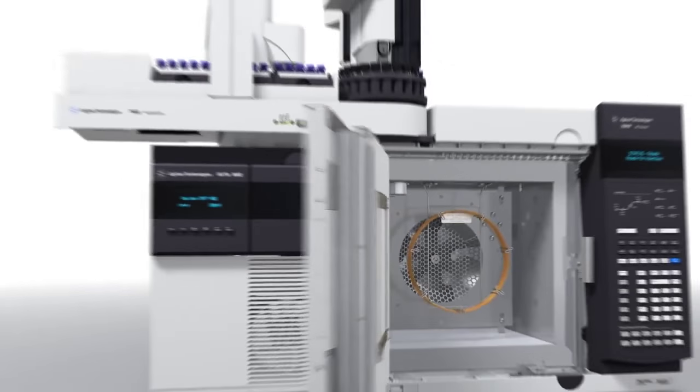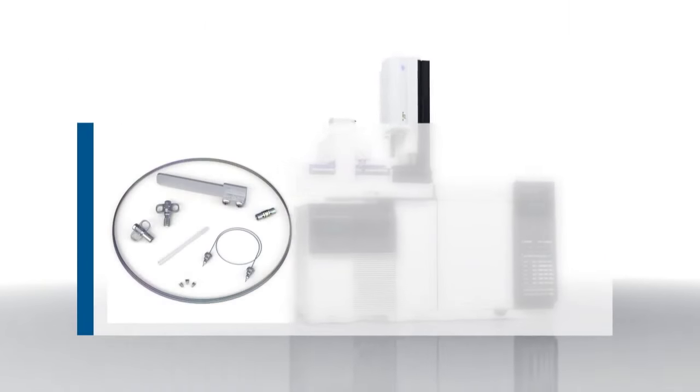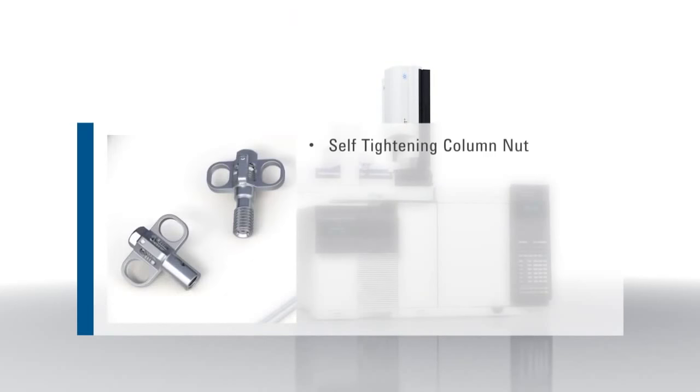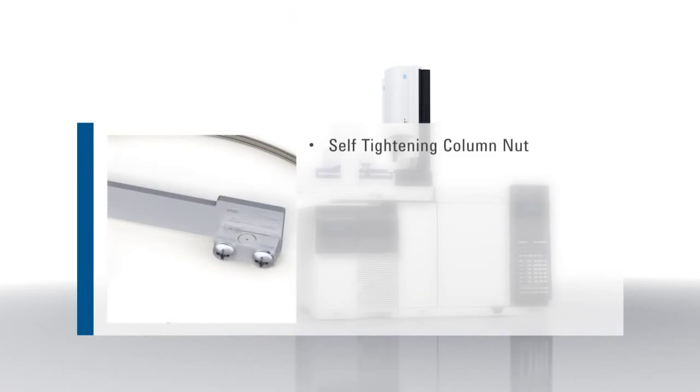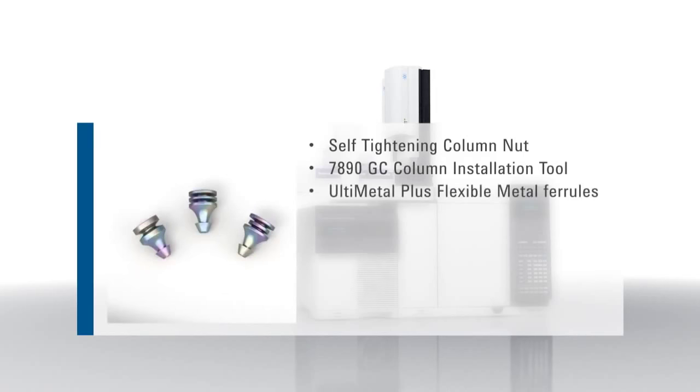With these innovative tools, all chromatographers can install and maintain proper GC column connections, easier, faster and more reliably.